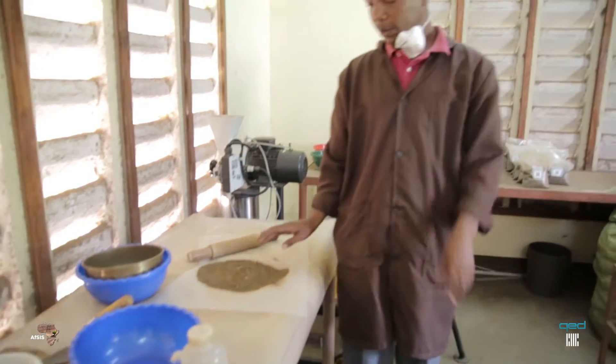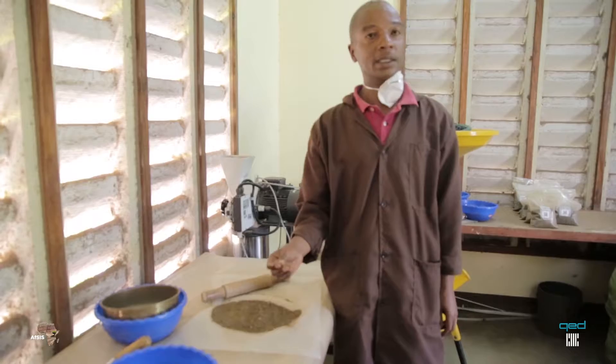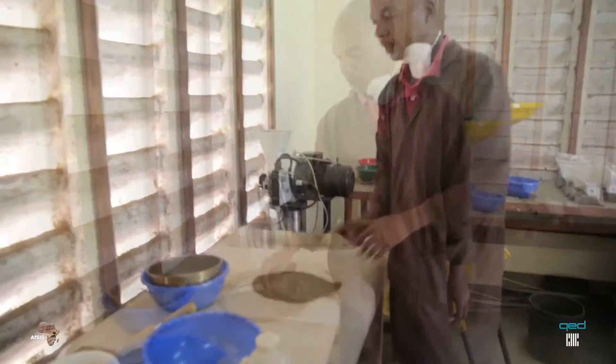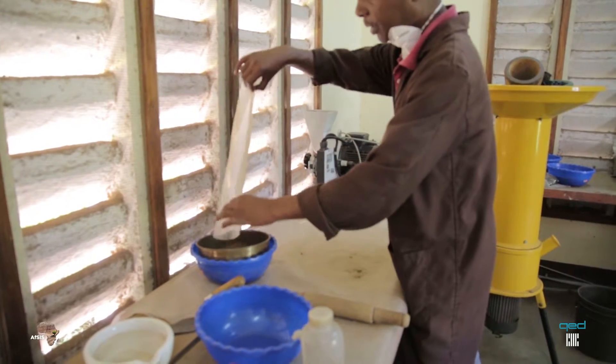All the material which is not part of the soil, we have to remove — such as the roots, like this one. Then you return. After grinding, you return to the sieve mesh.